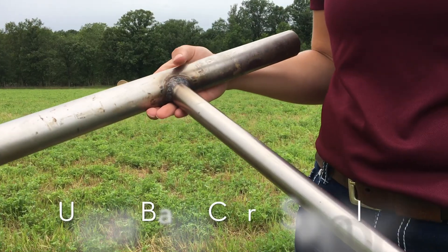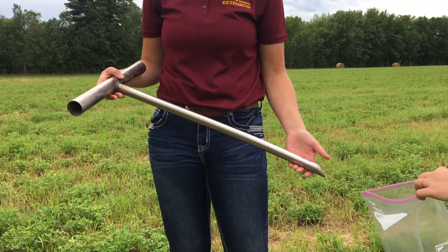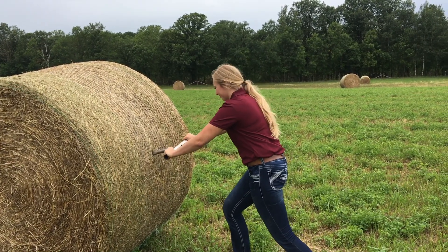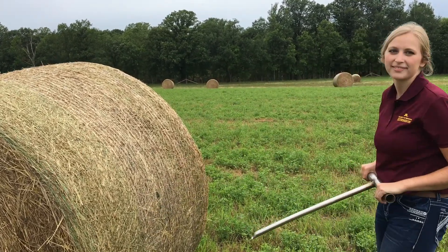Use a properly sharpened bale core sampler to reduce sampling error. An 18 to 24 inch long bale core sampler with a diameter of 3 quarters of an inch wide. This ensures you get enough of a forage sample to submit to the lab. Sampling without a bale core will result in an erroneous representation of stem versus leaf material.